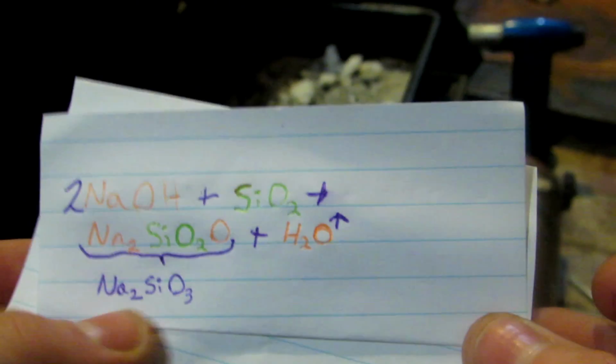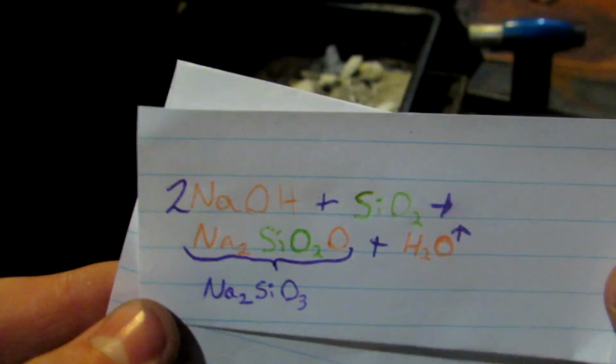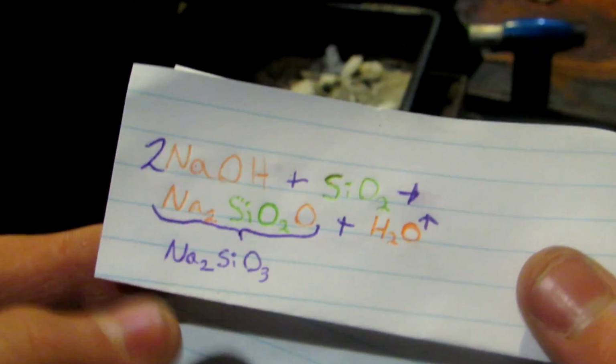So this is what will be left over, as well as excess sand, and any impurities that didn't dissolve, and most likely still some sodium hydroxide. Luckily though, because sodium silicate is soluble in water, after we make the sodium silicate, we'll just take everything, throw it in water, and filter off any excess impurities which will not dissolve, leaving us with a fairly pure solution of sodium silicate, and then ready to go on to the next step of purifying it. So, I'll just continue to mix this until it's all liquidy and melted and mixed together really, really well. And at that point, I'll be back.